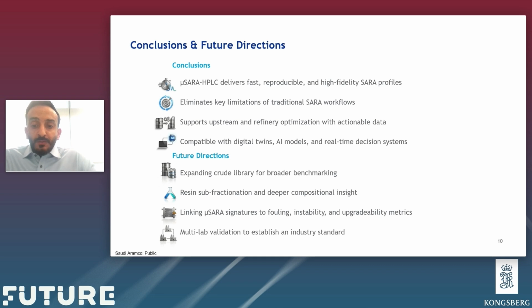We're also working on resin subfractions for deep chemical insights, and evaluating how micro-SARA patterns could correlate with refinery performance in downstream cases, with indicators like fouling and stability. As this progresses, with a standardized SARA system, multi-lab validation will help define a reproducible industry standard for SARA analysis.